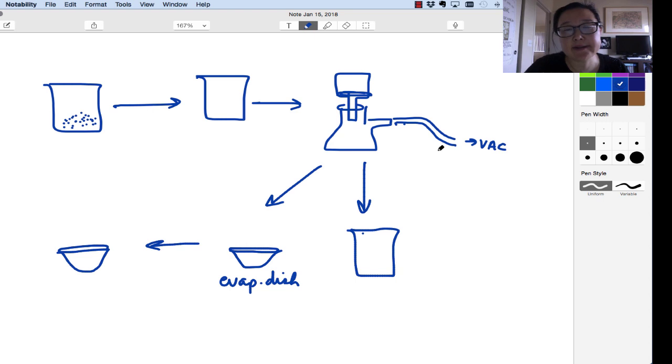In doing that, you're going to learn about chemical and physical separation processes and some techniques such as filtration and evaporation, how to use a Bunsen burner, and things like that. So let's start off right here.